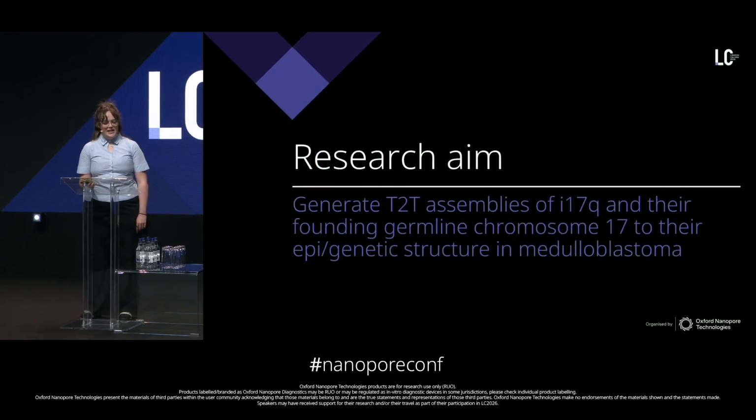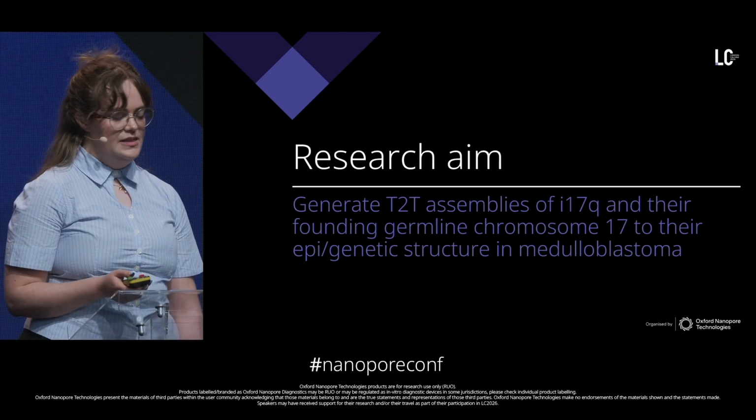So this was my research aim, to do a T2T assembly of isochromosome 17q, but also the founding germline chromosome 17, to investigate both the epi and genetic structure in medulloblastoma.